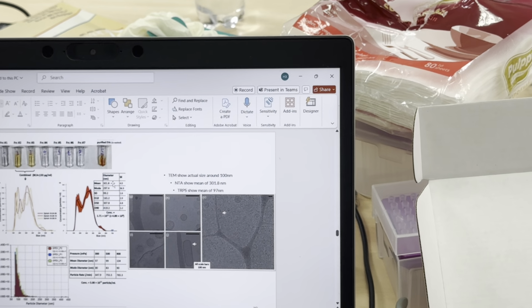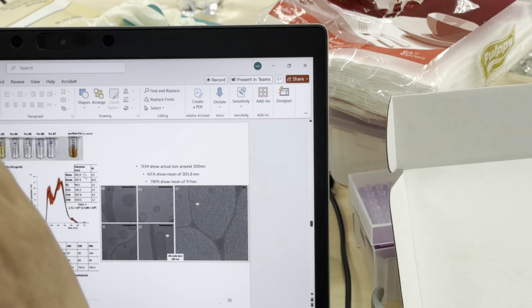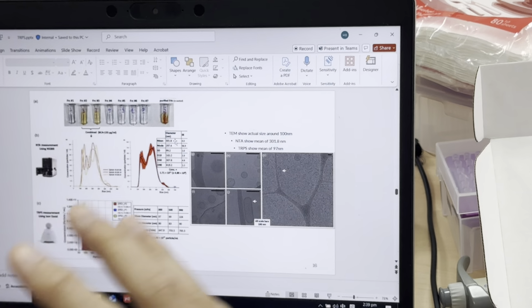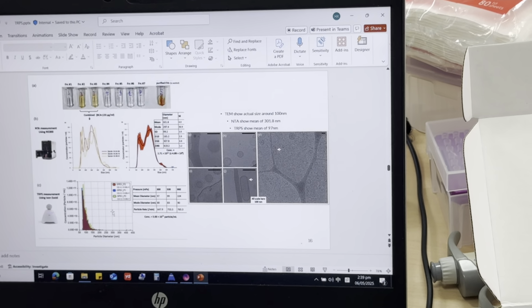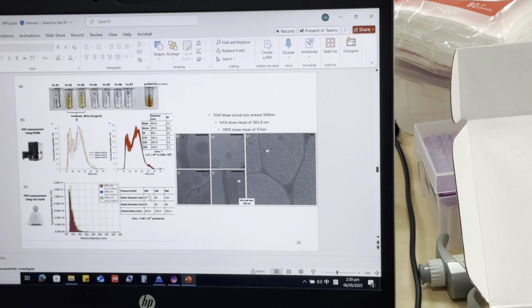The reason is that EV samples are not a mono distribution. It's a multiple-peak distribution, and an optical method just gives the wrong estimation of it. But they used our EXOID and got a 97 mean size. That's good.